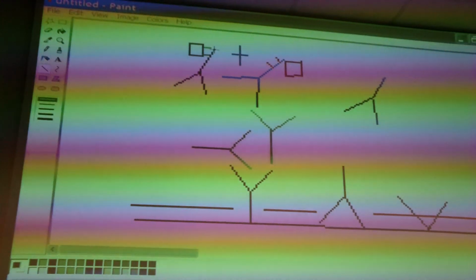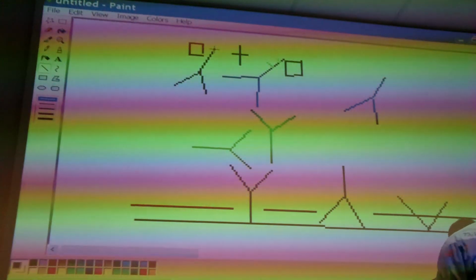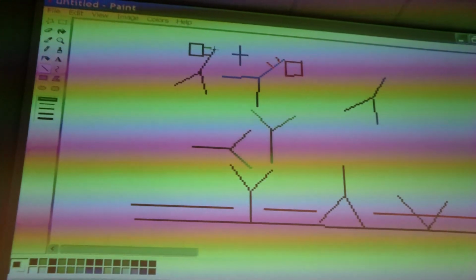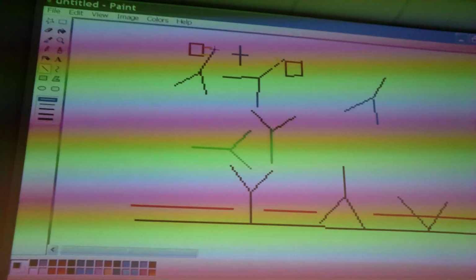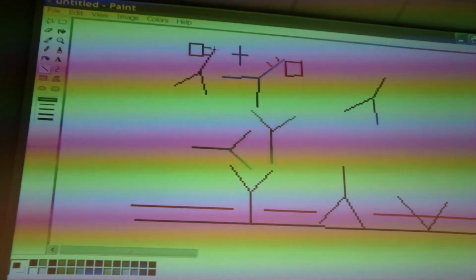Okay. Now imagine you had antibodies in there. After all you get the enzyme bound there. How do you get a signal? How can we measure something? The substrate for HRP, which is TMB, for example, makes a colorless substrate into a colored product using the enzyme.